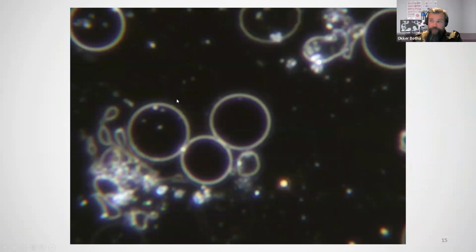And again, with the incorrect settings, if you don't have the correct strength in the light source, which is the first and one of the most important things to look for, and then if you don't have the right type of dark field condenser, then obviously you're not going to get the clarity that you should get, and these structures won't be visible in the plasma at all.